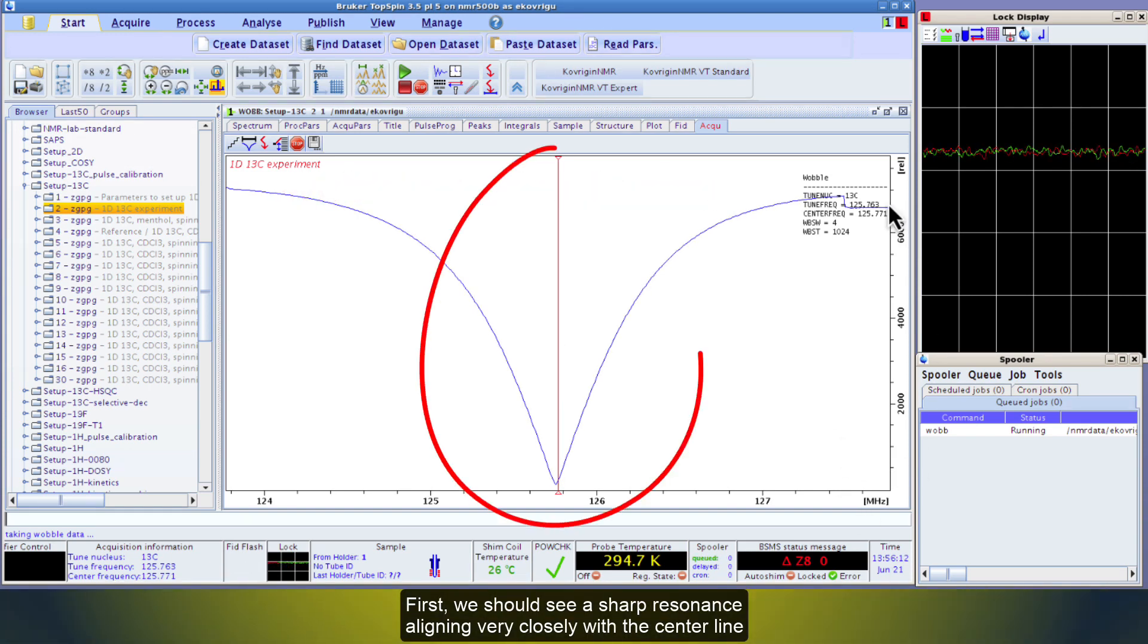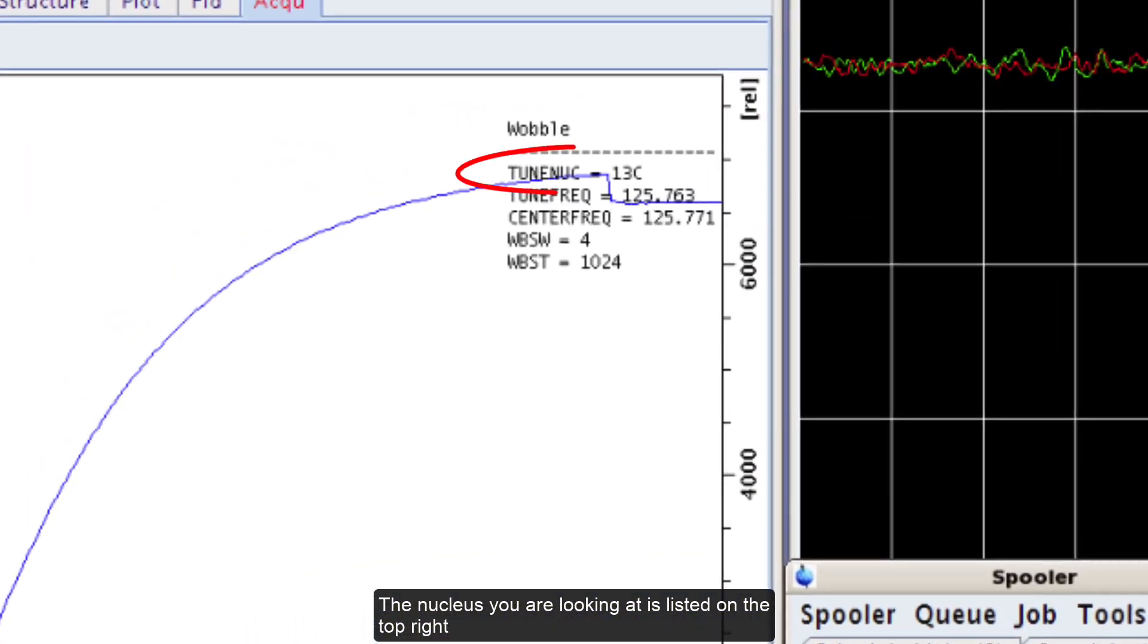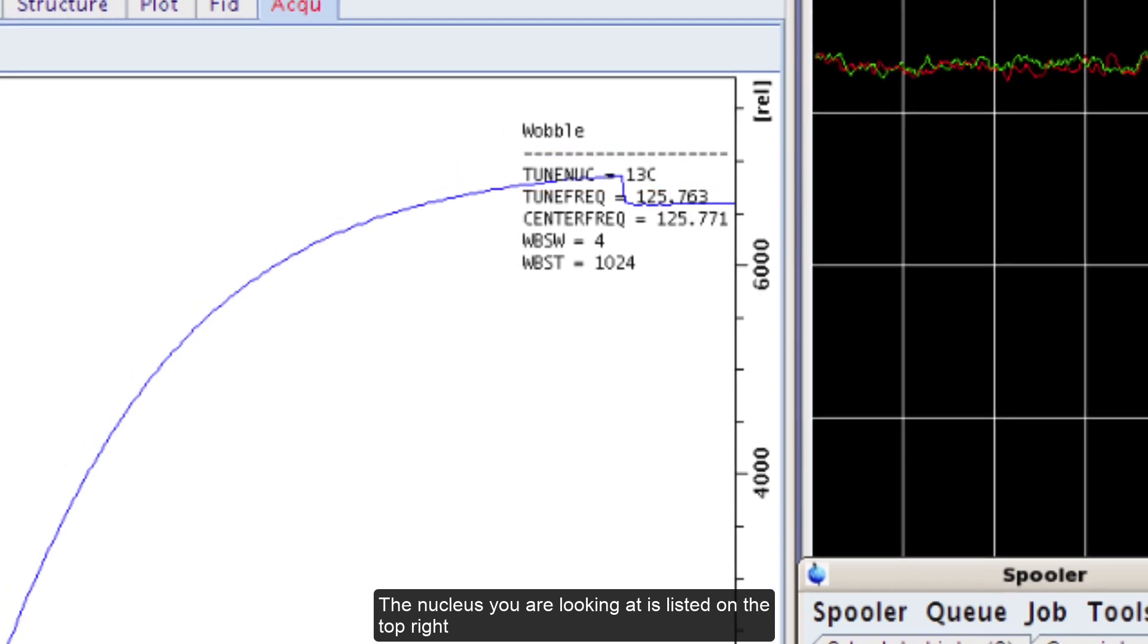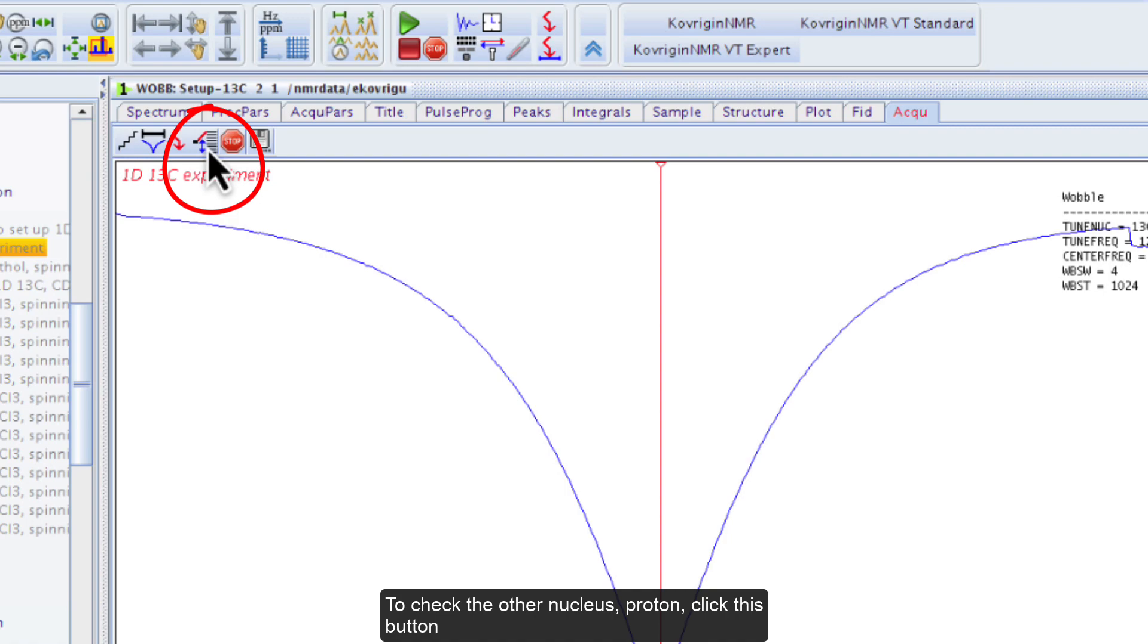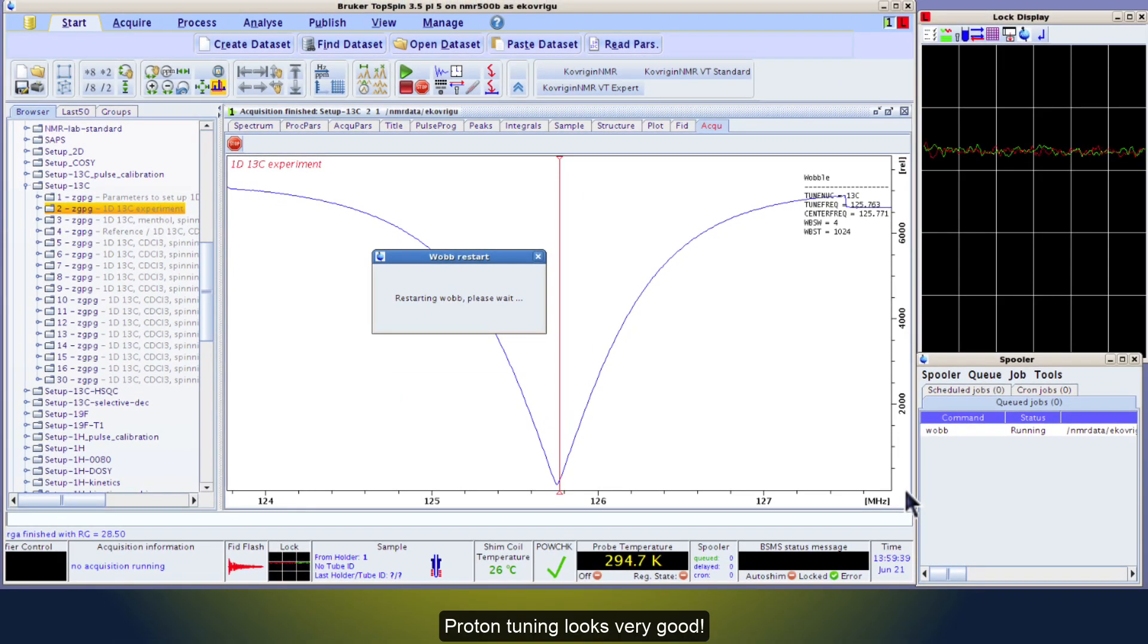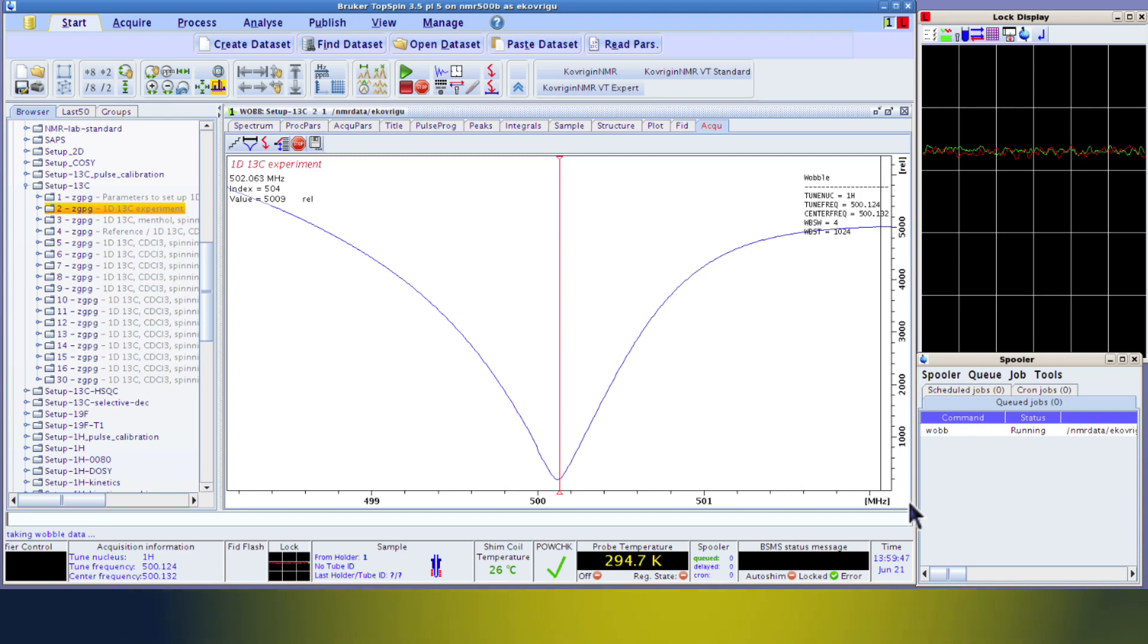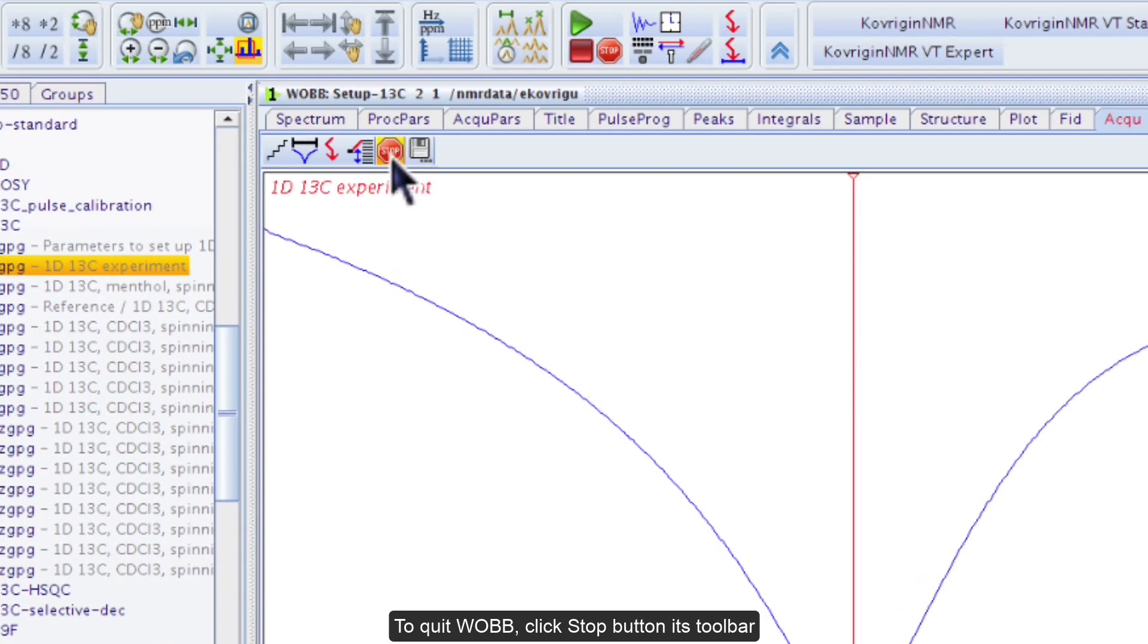This screen will not disappear until we tell it to. First, we should see a sharp resonance, aligning very closely with the center line. The nucleus you are looking at is listed on the top right. To check the other nucleus, Proton, click this button. Proton tuning looks very good. To quit Wob, click Stop button in its toolbar.